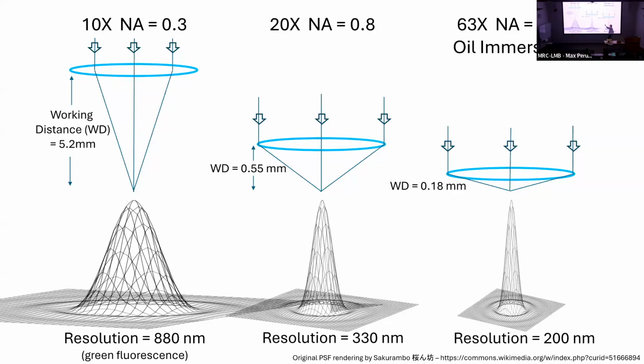So when we go to the highest NA lenses, like a 1.4 NA oil immersion lens, the working distances are tiny. You can only work with cover slip samples. You cannot use this lens to look through the bottom of a 1 millimeter plastic cell culture dish. That one will happily do so. That's worthwhile keeping in mind.